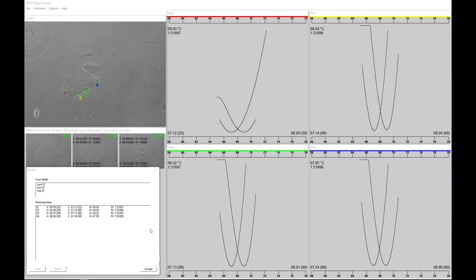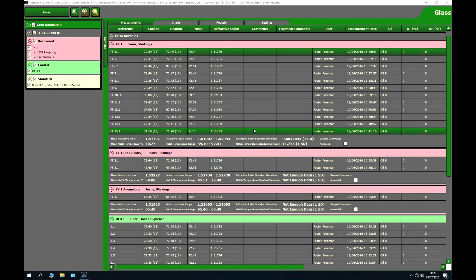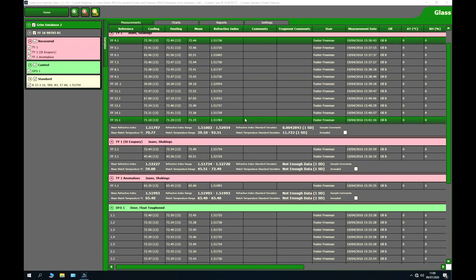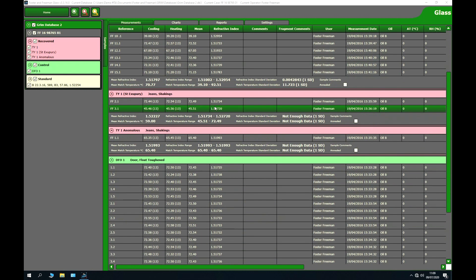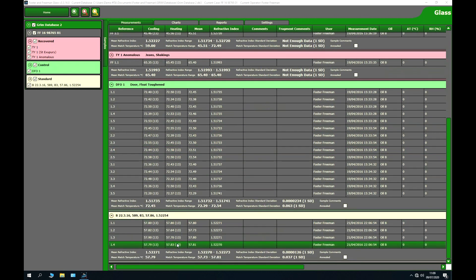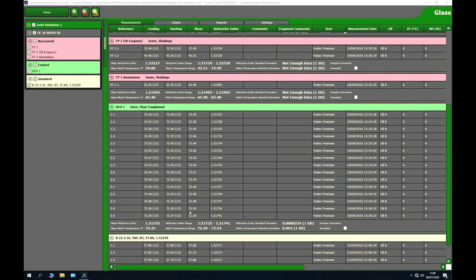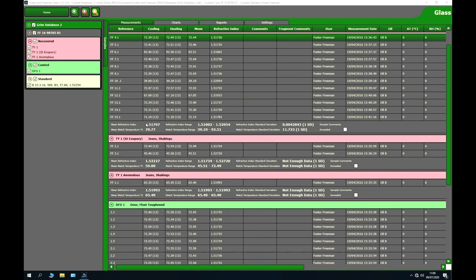These results can then be imported into the glass management software. In the glass software, a typical scenario is shown where recovered glass fragments appear in red, control fragments in green, and the standard in yellow. We can see all individual results and compare the mean refractive index, match temperatures, and standard deviations.